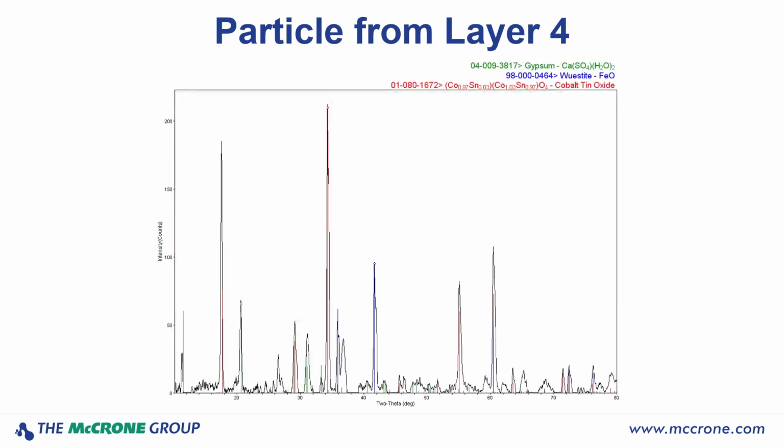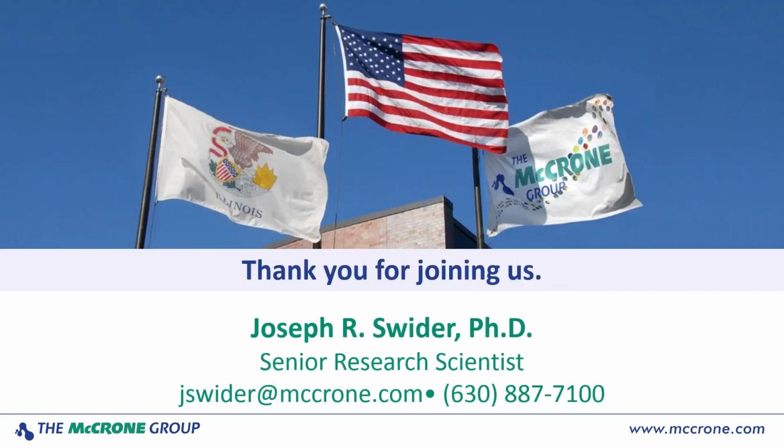X-ray diffraction of one of these particles showed gypsum, which is most likely from the ground, an iron oxide, and cobalt tin oxide pigment.